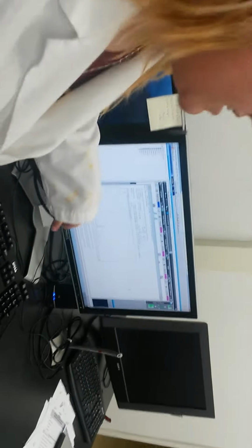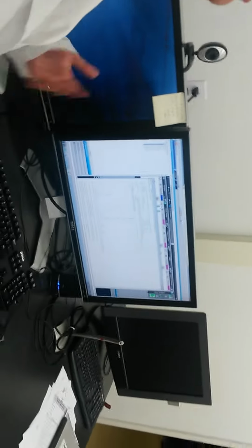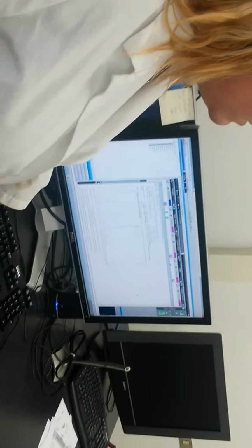These two peaks here are something else that the methylene chloride extracted out from the soda itself, which is expected. There's a lot of sugars in soda. But this 4.7 is your caffeine. Why is it so broad? Because it's above 20 parts per million in the machine. The higher the concentration you have, the broader the peak. That's the reason why.